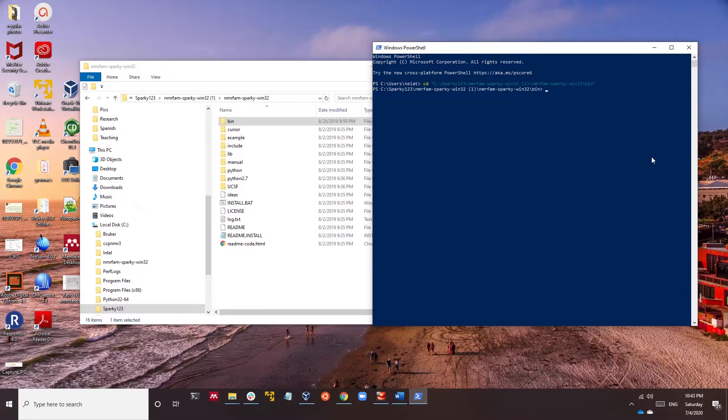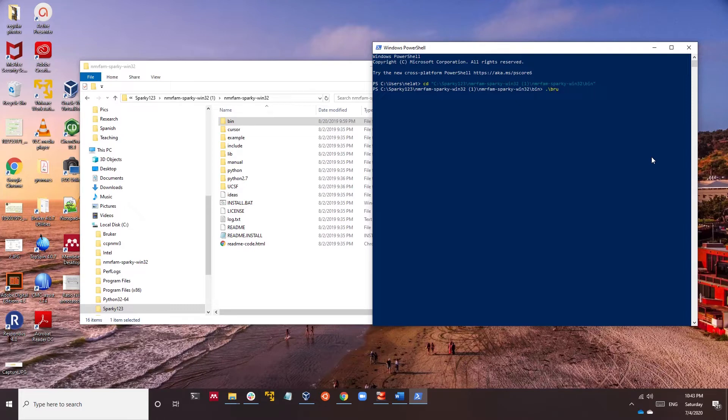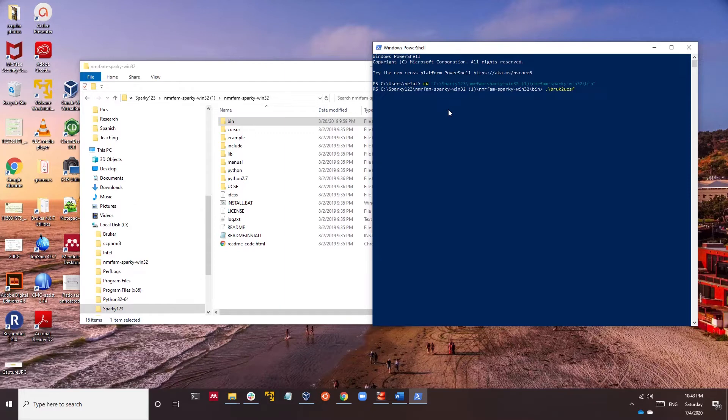Then you go to this place, CD path. And in there you can find your bruker2ucsf tool. So dot slash and then you can tab and find it. Space, and now we're going to put your old file, the Bruker file, and then the new location for the new file.